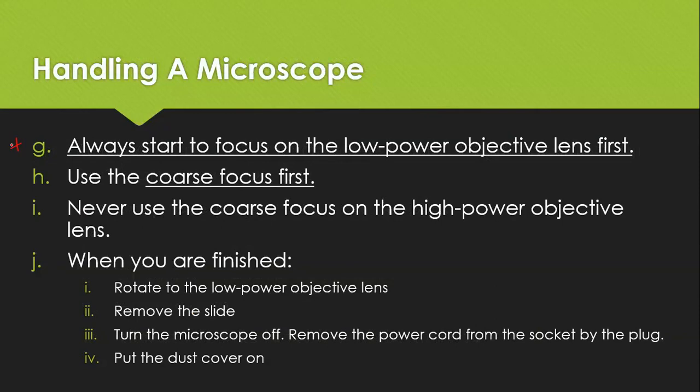Always start your focusing under low power. Okay, and then once it's focused, then you can go to medium, and then you can go to high. Never use the large knob, the coarse focus, under high power. Like I said, you can wreck your specimen and you can wreck the lens.